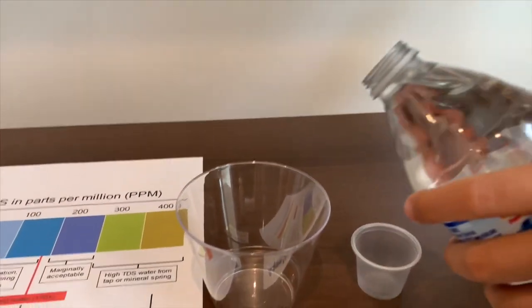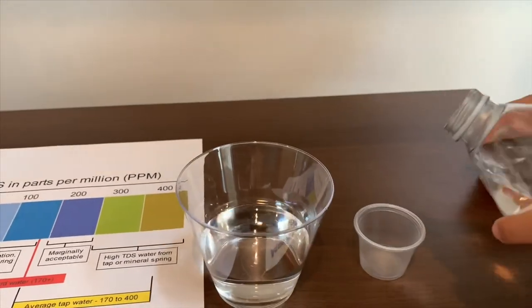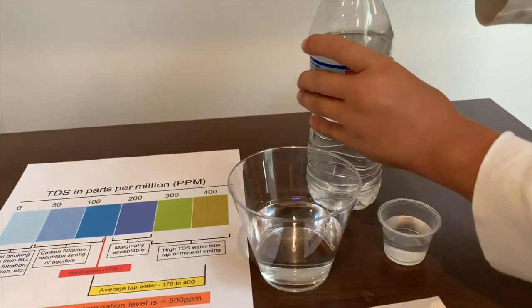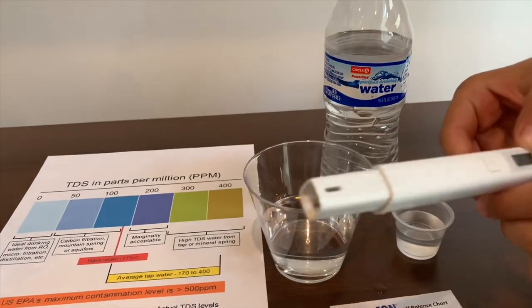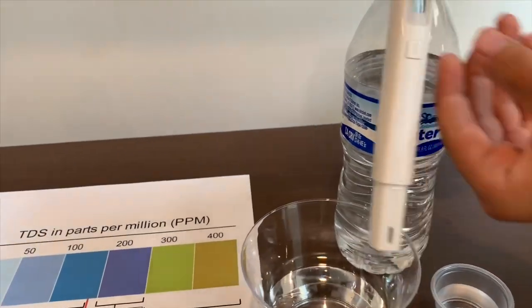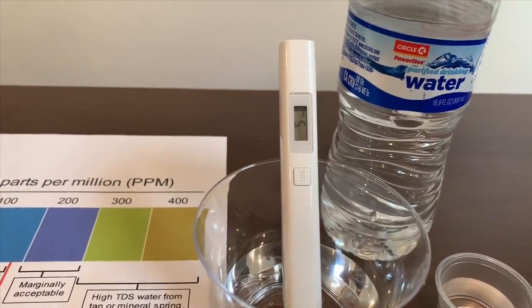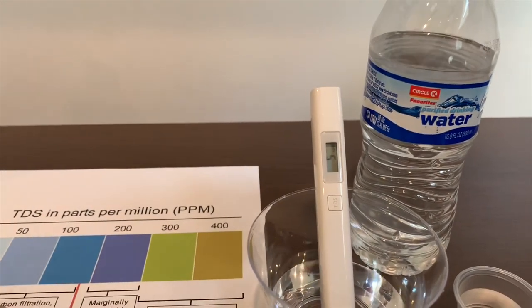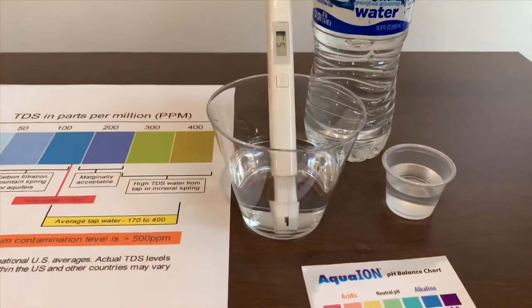First we're going to test the TDS, then we're going to test the pH. Turn on the TDS tester, make sure it says 0, and put it in. This reads 5, so it is also ideal drinking water — similar to Niagara's TDS level.